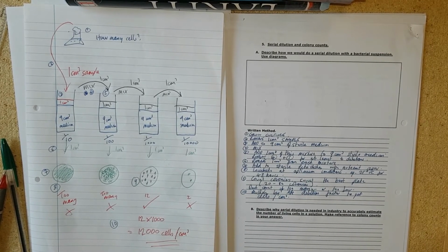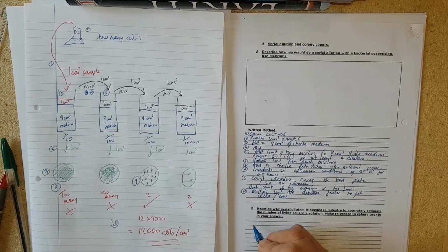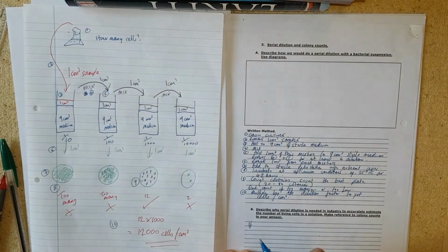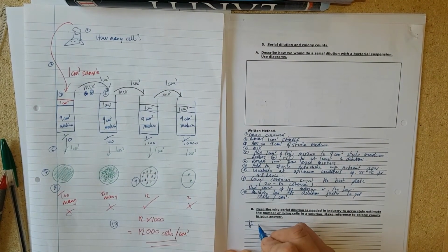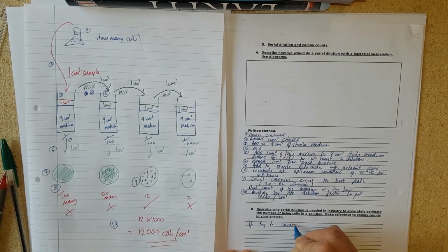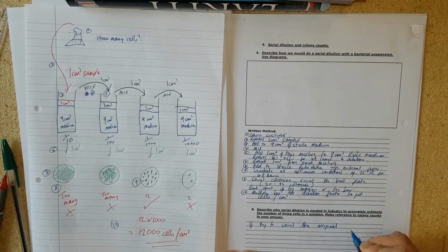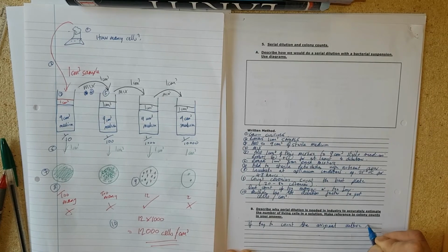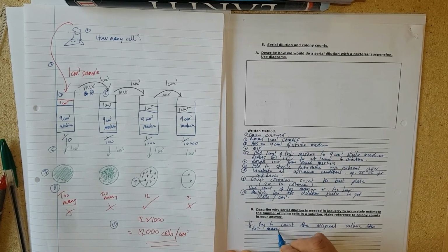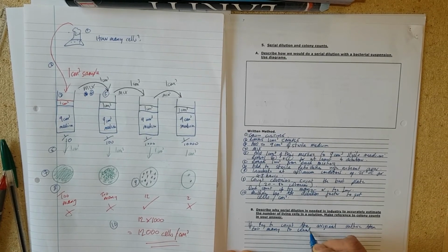Why do they do this? We just need to explain these too many and too few counts. So now let's describe this. If we try to count the original culture, then too many to count.